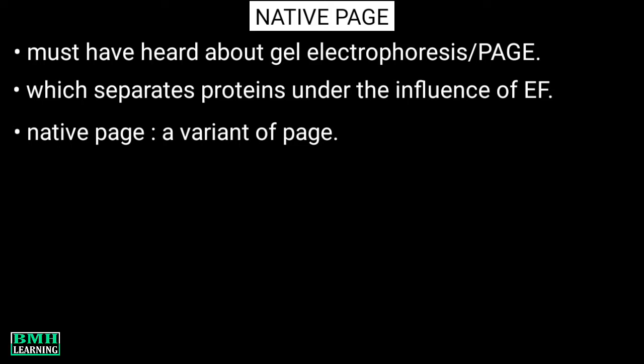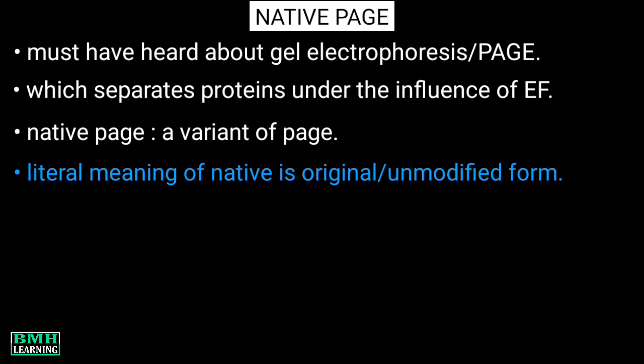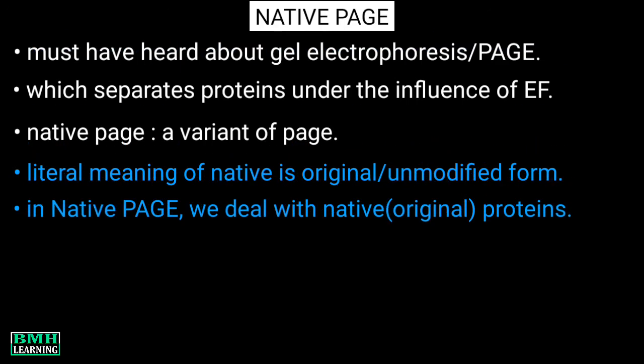Now, what is the meaning of native? The literal meaning of native is original. We can say the unmodified form. So, because we are talking about polyacrylamide gel electrophoresis, native here actually deals with the original form of proteins.